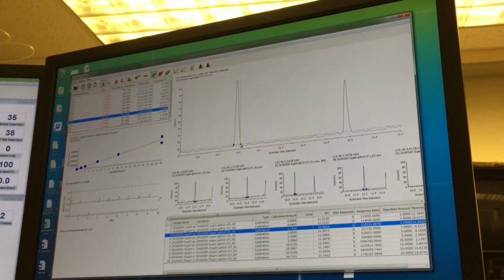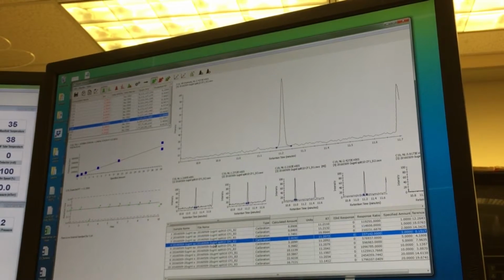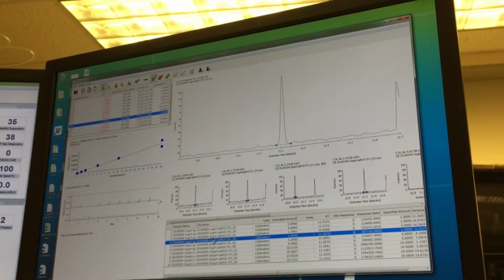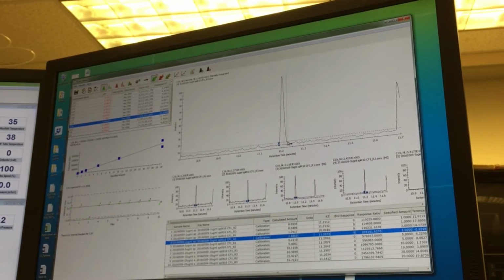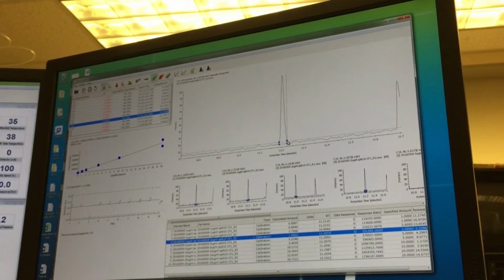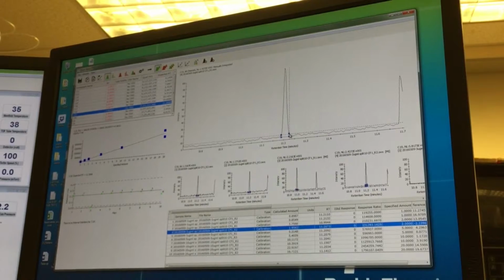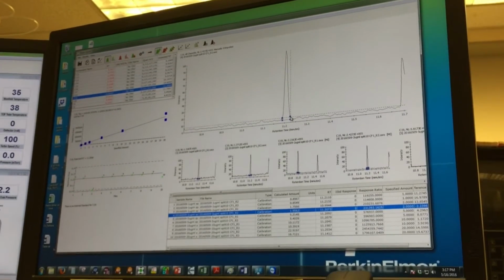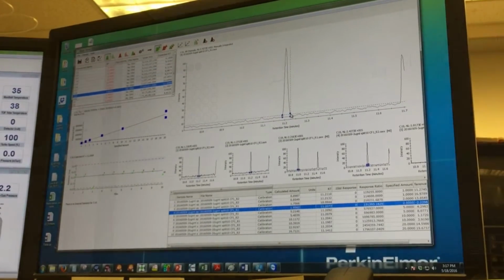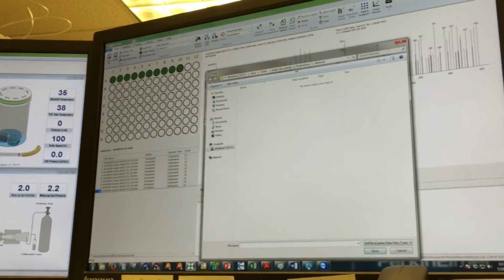So it's in your hands. I can't show you everything, it's like trial and error, and you have to try some manual tuning. Then you have to choose which one you want to choose. Okay, so this is the way you build it. For this sample, it depends on which component and which calibration point you want, so you do it differently. But this is the way I'm just showing how to make the calibration curve. So here, jet fuel, then add one jet fuel sample.